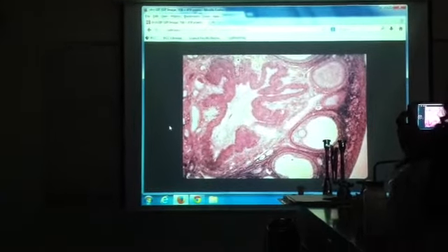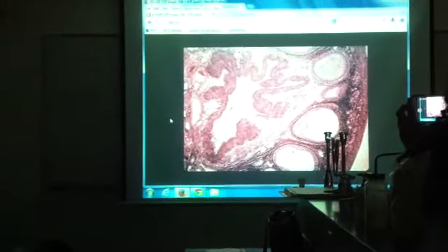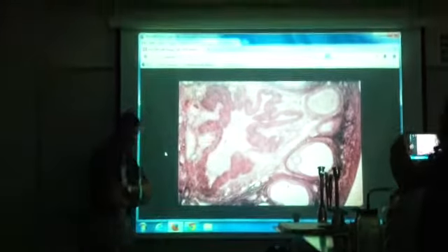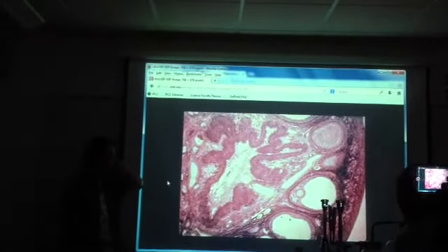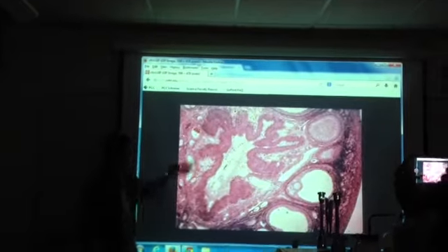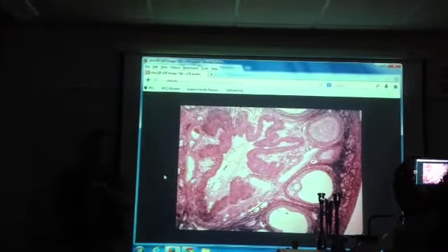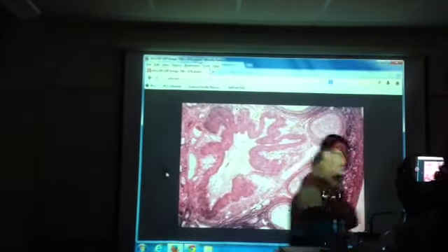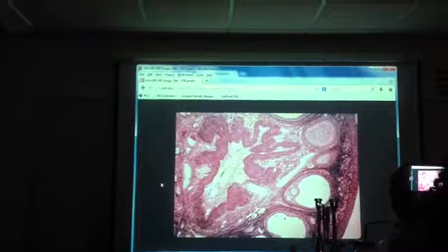The thing on the left is what I'm interested in, not the things on the right. That's the corpus luteum. How did you know that was a corpus luteum? Because it looks like one. It looks like one, indeed. Corpus luteum, they look puffy, cloud-like, they don't look like round follicles. That's the old follicle. When this egg left, or will leave, we'll get this. So there's a corpus luteum. They look puffy, cloud-like, some people say. Corpus lutea there.